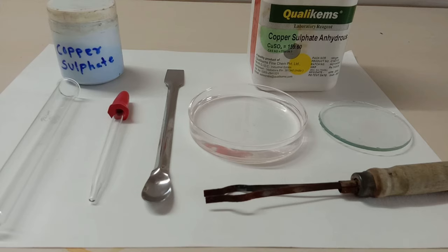So I'm back with a very good demonstration in chemistry, and this is a very important concept for grade 9 and 10 students. Here we are going to understand the effect of heating on hydrated copper sulfate, which means copper sulfate with 5 water molecules, CuSO4.5H2O. It is basically a blue colored salt, so when you heat it over the Bunsen burner, it loses the 5 water molecules which are physically attached to it, and it becomes dirty white.